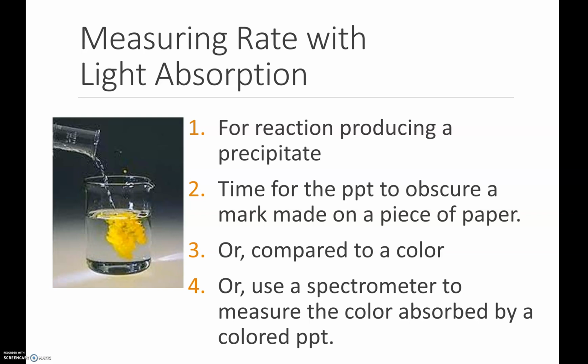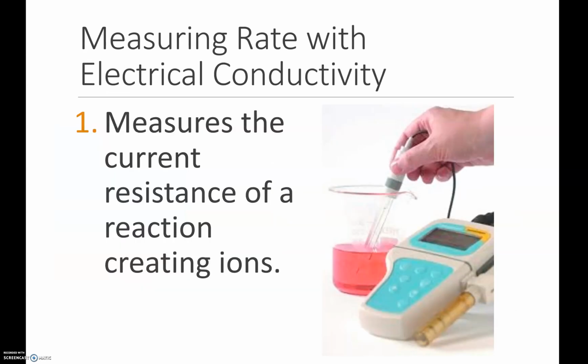Again, this would be one that we're not going to do in the lab because of the materials that we have. However, it would be one that you would need to identify on an examination as a way to measure if a precipitate is produced.